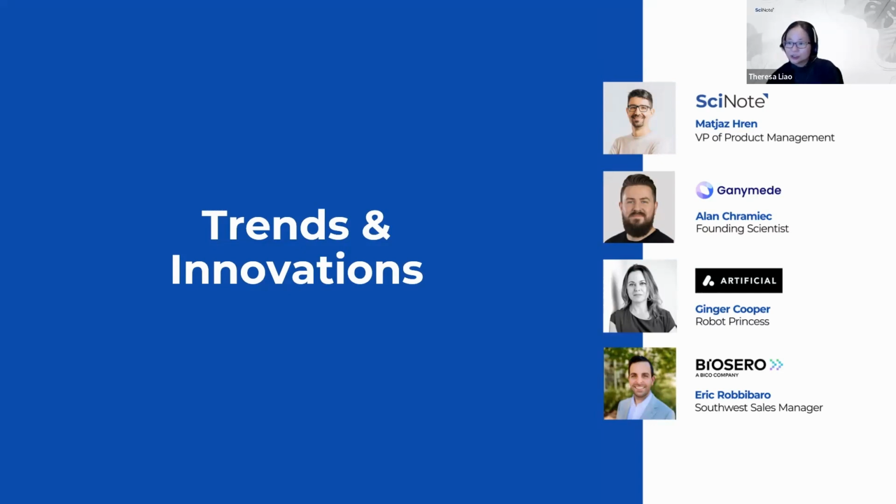Perfect. And then Ginger, do you have anything? What are your thoughts on this? Yeah, I feel like this might end up being a mini infomercial for everybody's platform. Sorry, all the attendees. Sorry, everyone. But obviously, from a digital lab perspective, just the ability to access your entire workflow from the cloud, wherever you are, is going to be hugely beneficial.